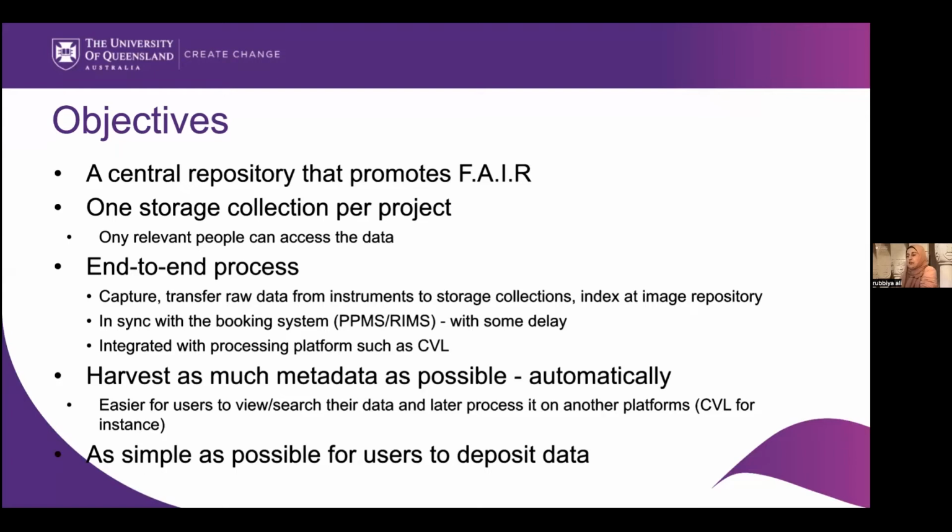The most important thing was, we were aiming to make it as simple as possible for users to deposit data, which in our case, we offered in two ways: directly from the instrument to the data storage, or through a web interface. We will explain these things later.